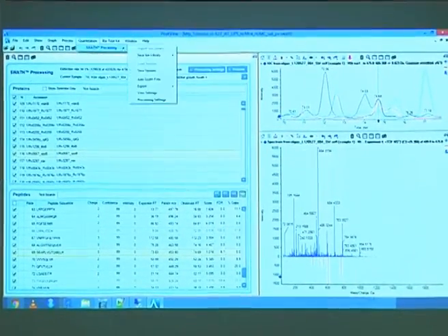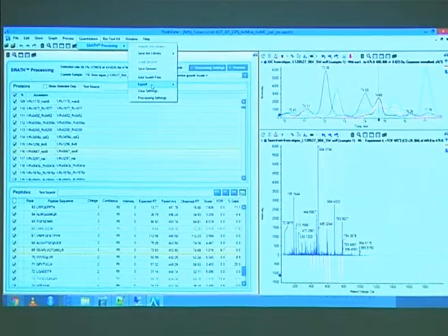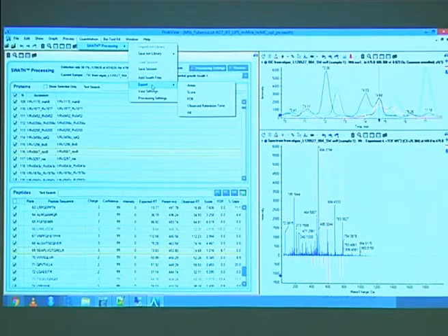Quantification, SWATH processing, save the session. And then what I would do is export the different data files. What you can export is the area, which gives you 3 files: the area of the ions here.